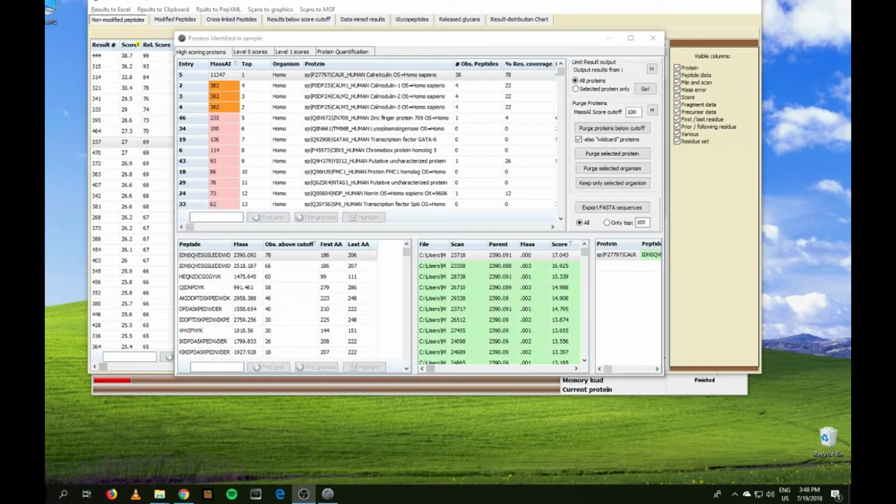In this episode, we will take a look at the results generated from last episode's search. In the last episode, we did a quick and dirty search against an MGF file and with the entire human proteome as a search space. Like I said, the search was very simple.